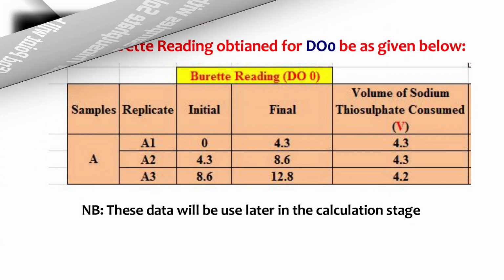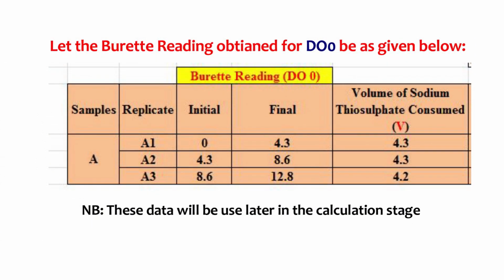Let the burette readings obtained from the titration be as given below. This reading is the DO reading of the samples which has been analyzed immediately after the sample has been collected. For information, this data will be used later on in the calculation stage.